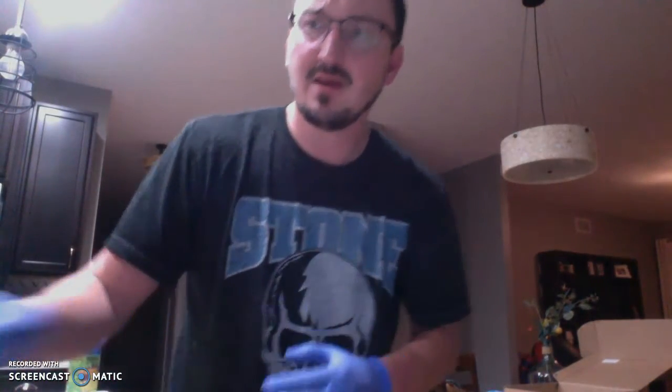So last but not least, we're supposed to talk about the meninges. The meninges is the outer covering of the brain, and there was actually a lot of meninges here. That's part of it that I removed off of the sheep brain. So those are all the sections.